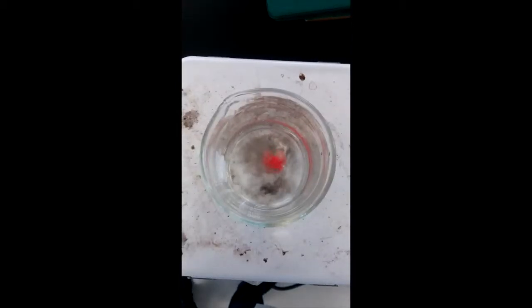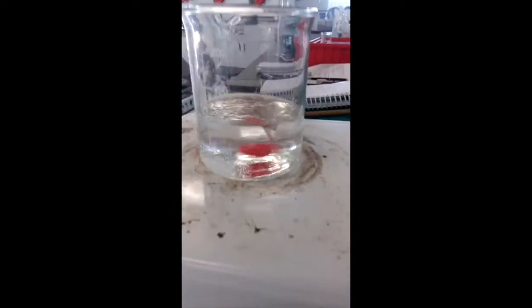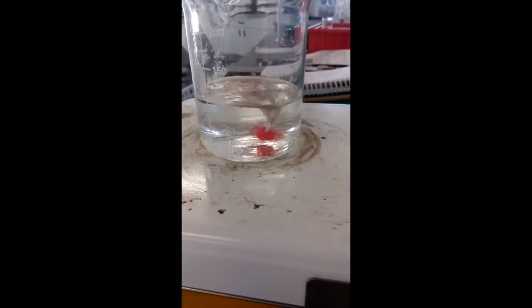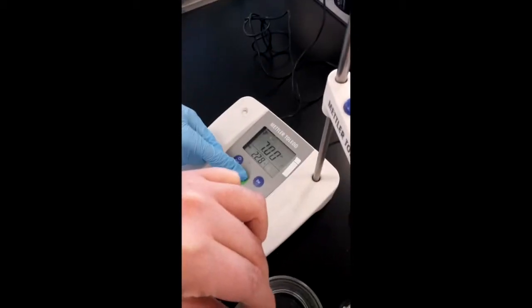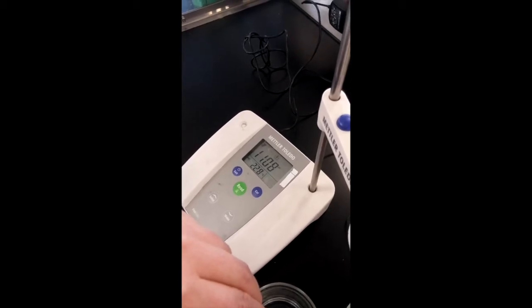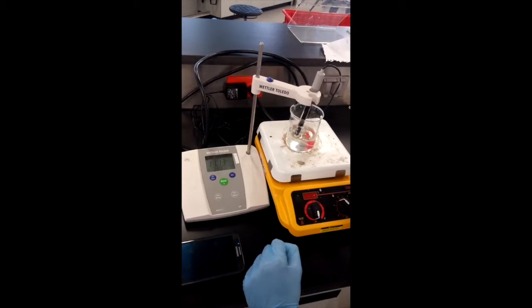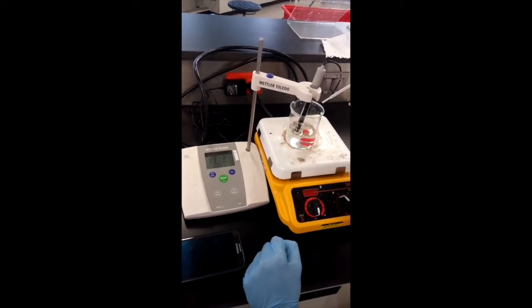To prepare 100 milliliters of the 1 molar Tris-hydrochloric acid solution, 12.1 grams of Tris base were used in order for it to be in a 1 molar concentration. The Tris base was dissolved in 80 milliliters of distilled water. The pH had to be adjusted to 8 and it started with a value of 11.15.